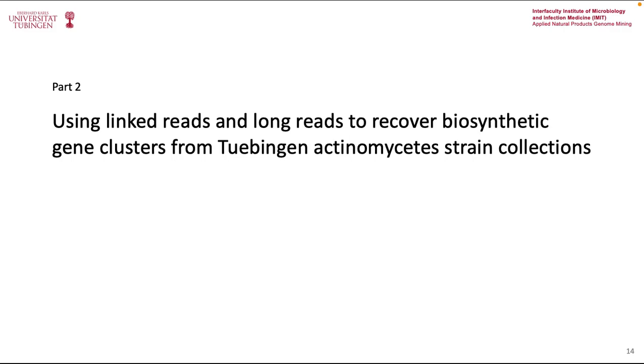Now I come to the second part of the presentation. Since we are interested in discovering novel natural product BGCs, sequencing and mining complete strain collections, specifically actinomycete strains, is also an alternative strategy as compared to exploring the soil metagenomes. In case of soil, very high sequencing depth, maybe to the magnitude of a few terabases, would be required to recover complete metagenome assembled genomes of all the species present in a particular soil sample.